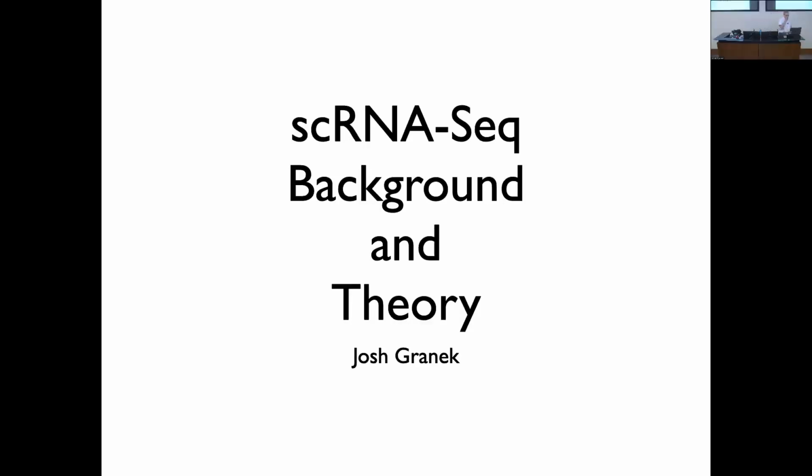Okay, so this is the first of three sessions that we're doing on single-cell RNA-seq. So today I'm going to be giving background and theory, explaining really how the technology works, and at a very high level talking about how we start to analyze it.